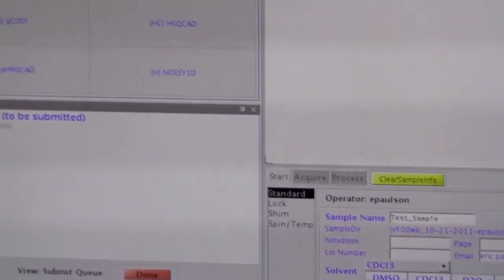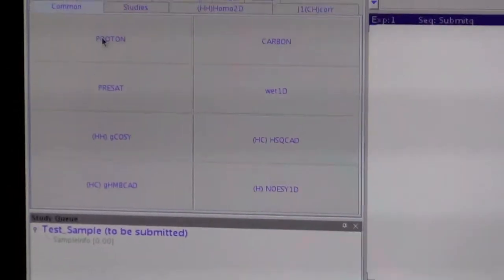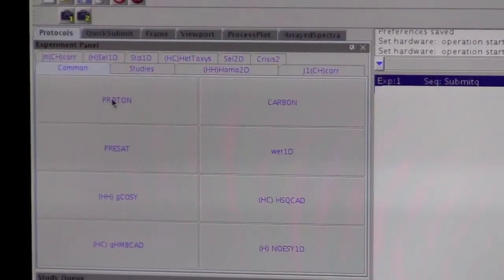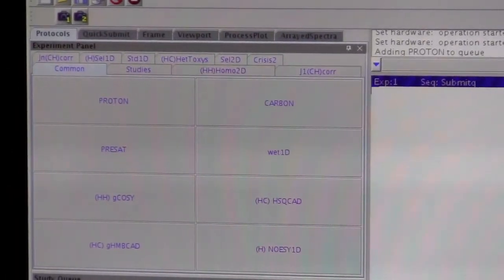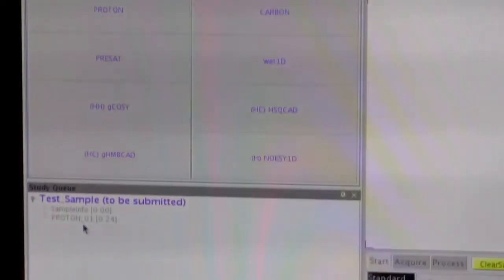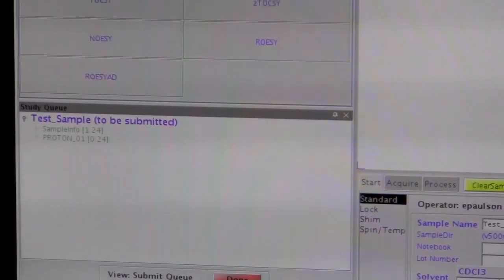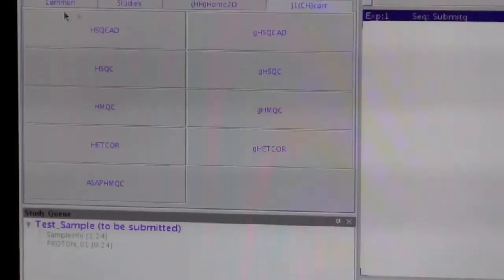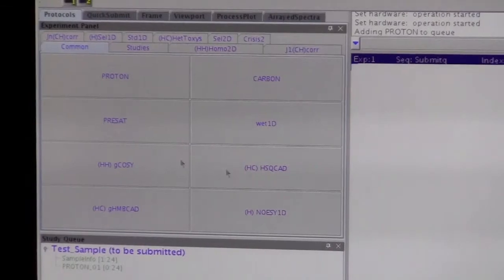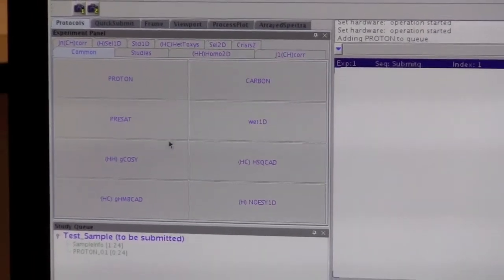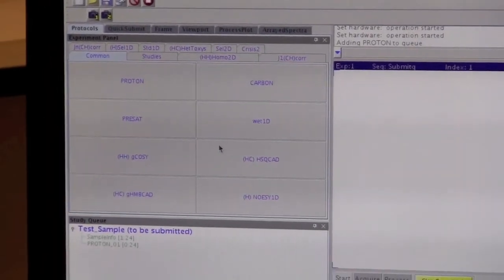So if we wanted to add a proton, we can click on the proton, and it'll add an experiment to the list. There are multiple tabs here, so not all of the experiments are showing on just this main page here.